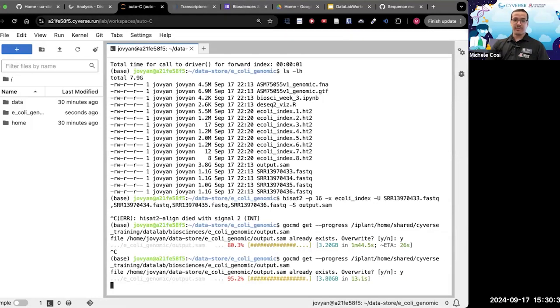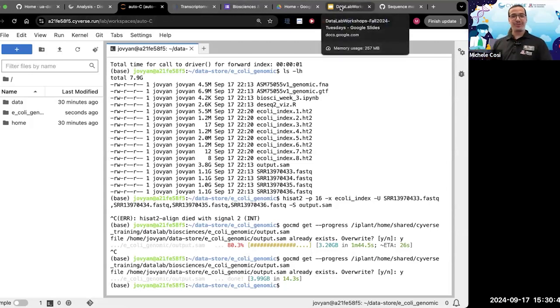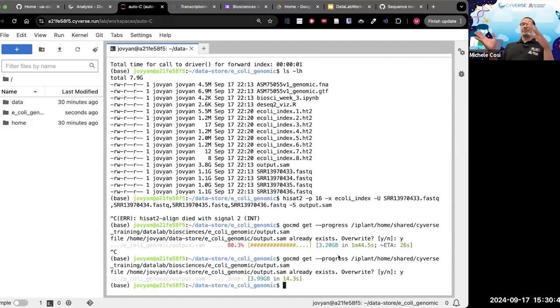Oh, there we go. We are passed. Okay, now, ideally, you should go through the exercise of getting the reads from the various FASTQ files onto a single SAM file. But now, if you do remember, in your own alignment, all of these reads may be pointing in one direction or the other. They're not in the right direction. I was pointing at the camera, I'm sorry.